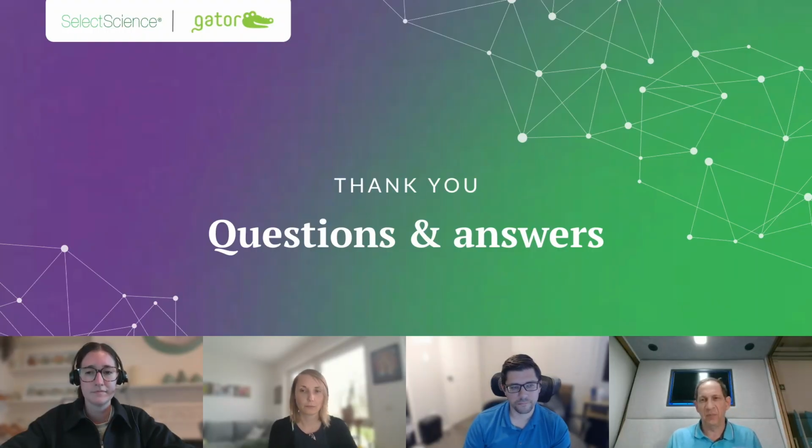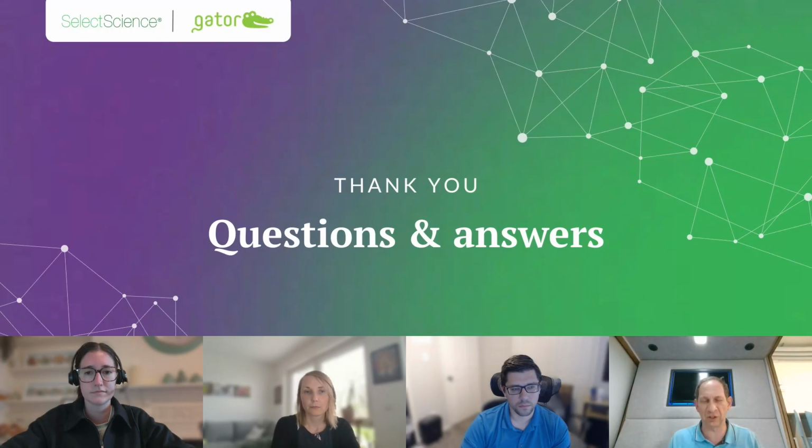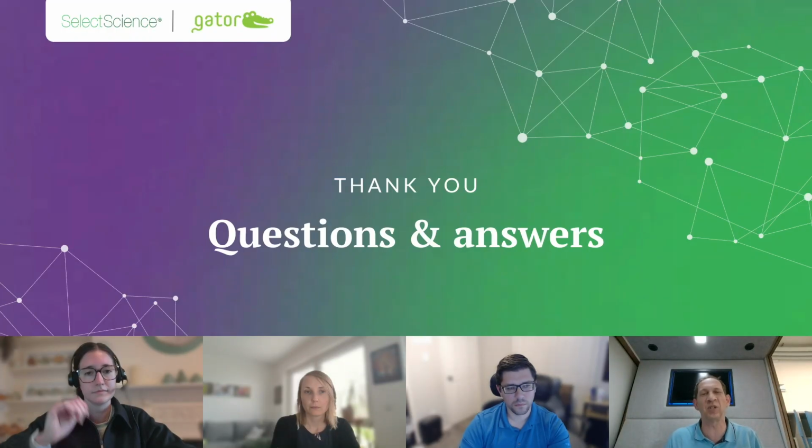Because in a high throughput measurement lab we have so many steps for so many projects, so much happening in parallel, the chance that there will be a human mistake somewhere along the process is high every single day just because we are running so many projects. And therefore, we need instruments that go every time to the same spot. They take every time from the same well to the other well.